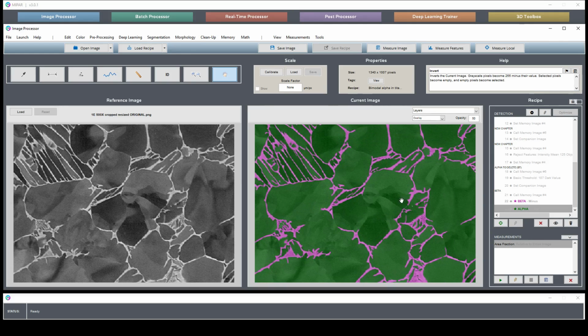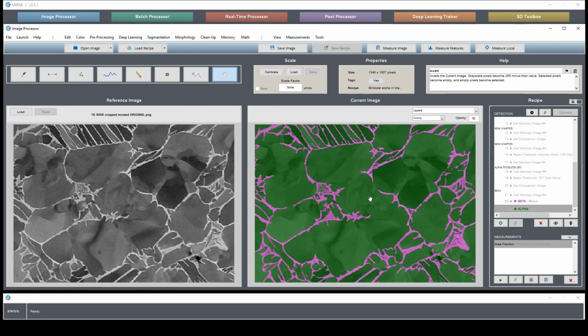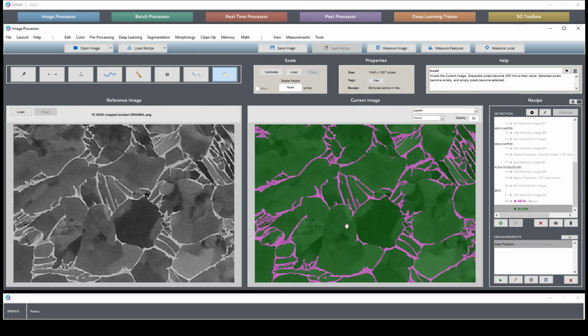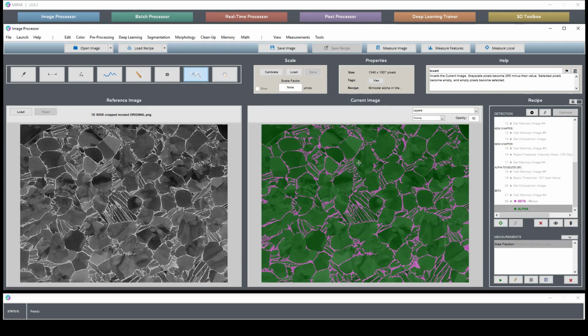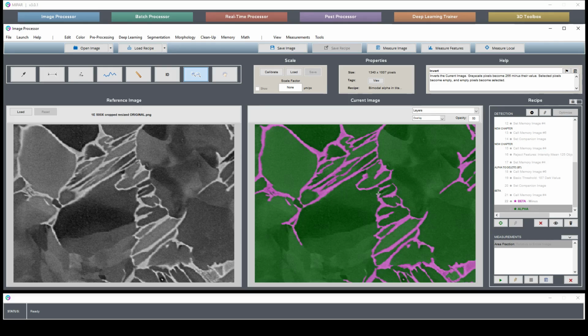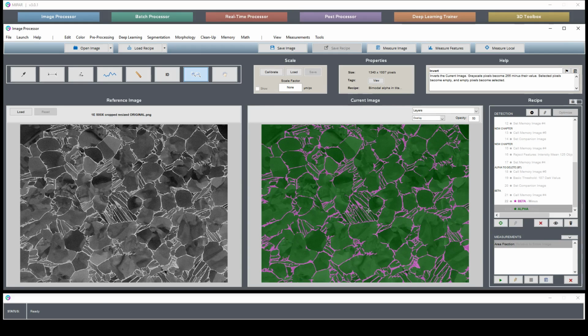One thing to note is that there's a little bit of pre-processing that we'll have to do in order for that to happen appropriately. So first, our separation of primary and secondary alpha isn't always 100% accurate. There's tiny little joins here and the joins here. And so we can remove these with an erosion. If we erode the alpha away, of course, this join will erode first.